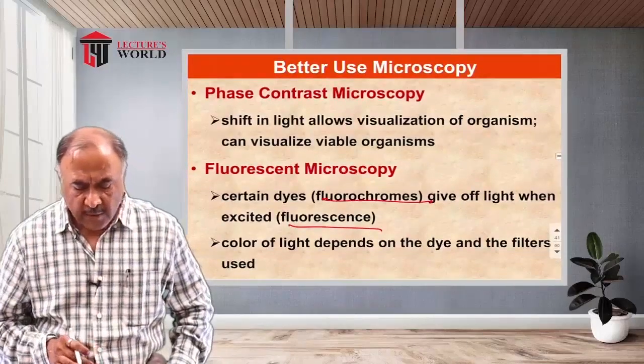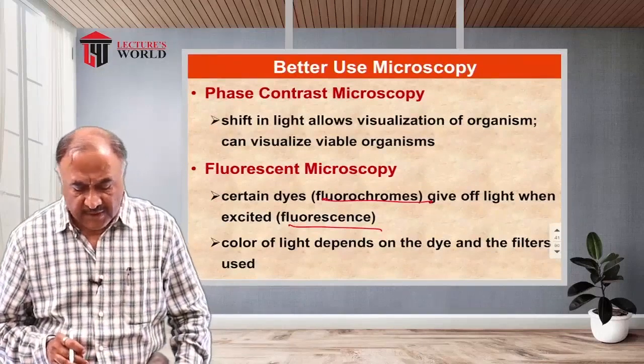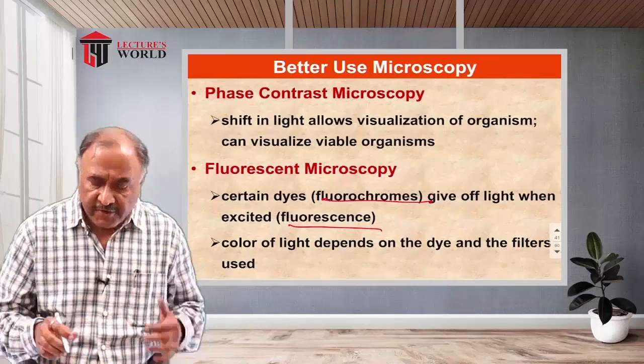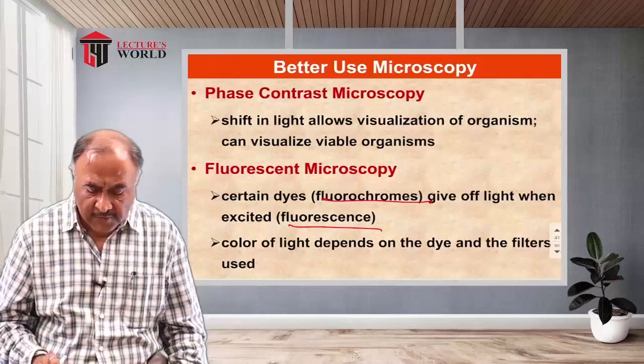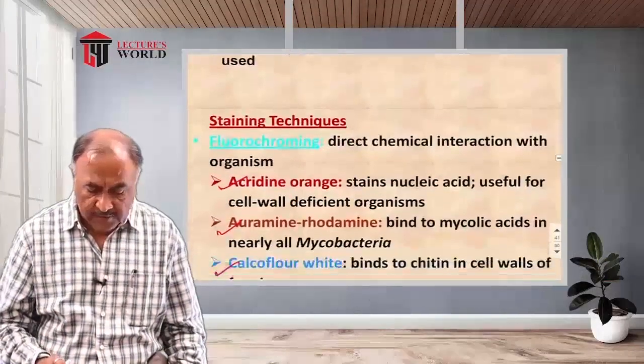Then, apart from fluorescent microscopy, we also have phase contrast microscopy. The shift in light allows the visualization of an organism, and we can easily see the microorganisms.